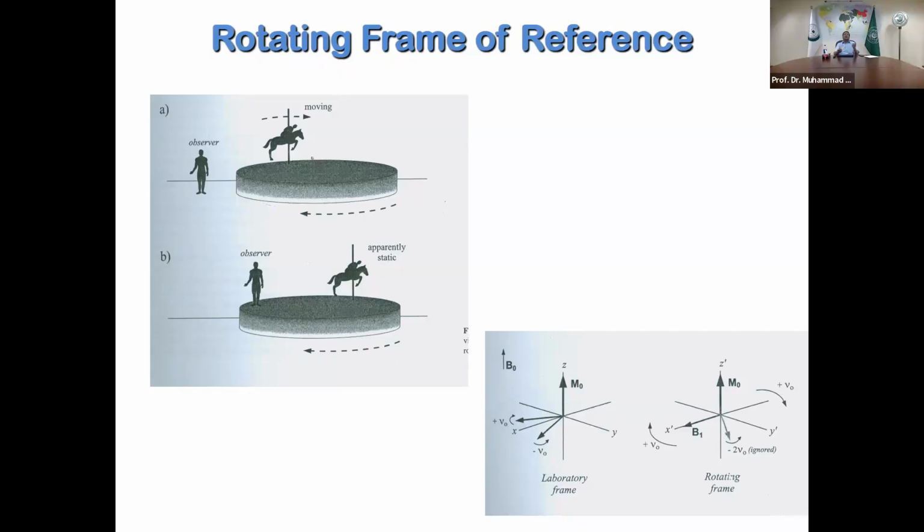Some are moving faster, a few hertz. Some are moving slower, a few hertz. And after some time, you'll see that one of them is moving forward, the other is going backward, because it is lagging behind. It's called lagging behind.